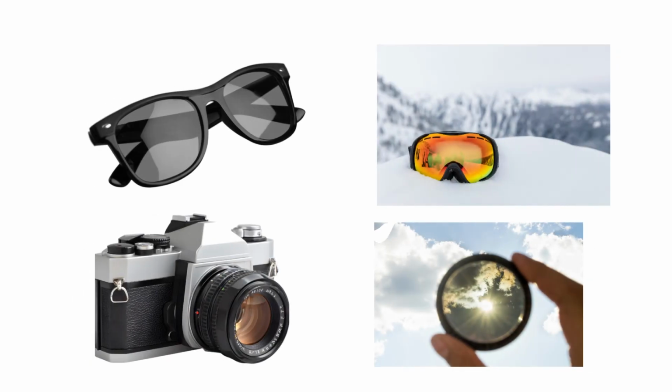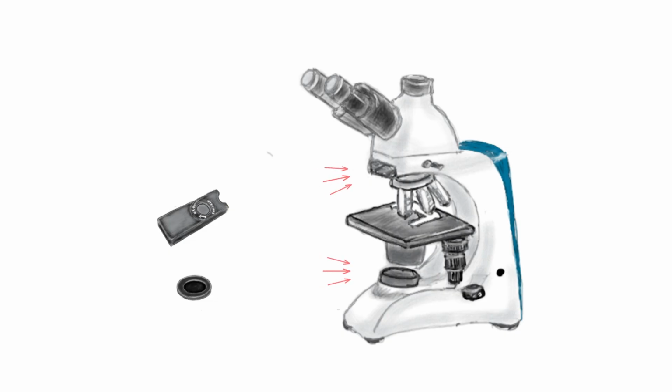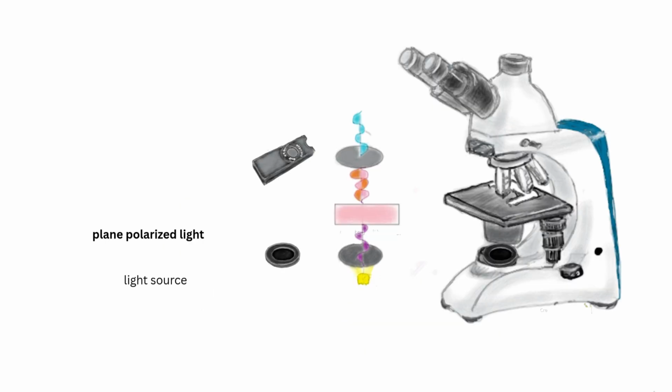Polarizing light filters apply to our needs in everyday life. And in the clinical lab, when we need to examine joint fluid for crystals in the polarizing microscope, two filters are applied. The rectangular polarizing filter goes into a slot near the microscope eyepiece, and the round one goes near the light source. The upper red arrows point to the lever that allows you to change the orientation of the polarizing filter 90 degrees back and forth. Both filters are positioned perpendicular to each other.